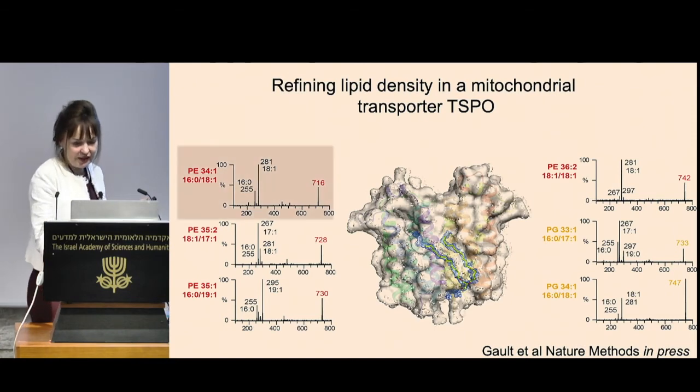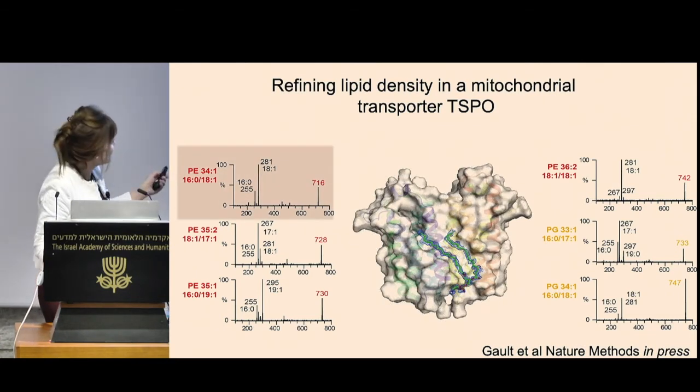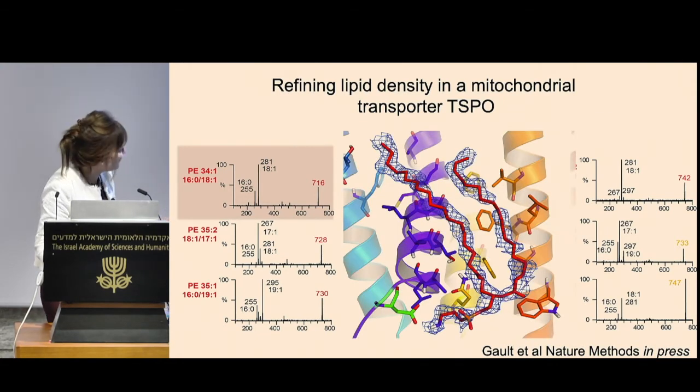And if we do that, it's this lipid, and then fit this in here, sit nervously in front of Richard, saying, oh, that's not a good fit. I think it fits much better than the original one, and there's all sorts of complementarities that we can make with the backbone of the protein to show that actually this is the right ligand to fit in this density.